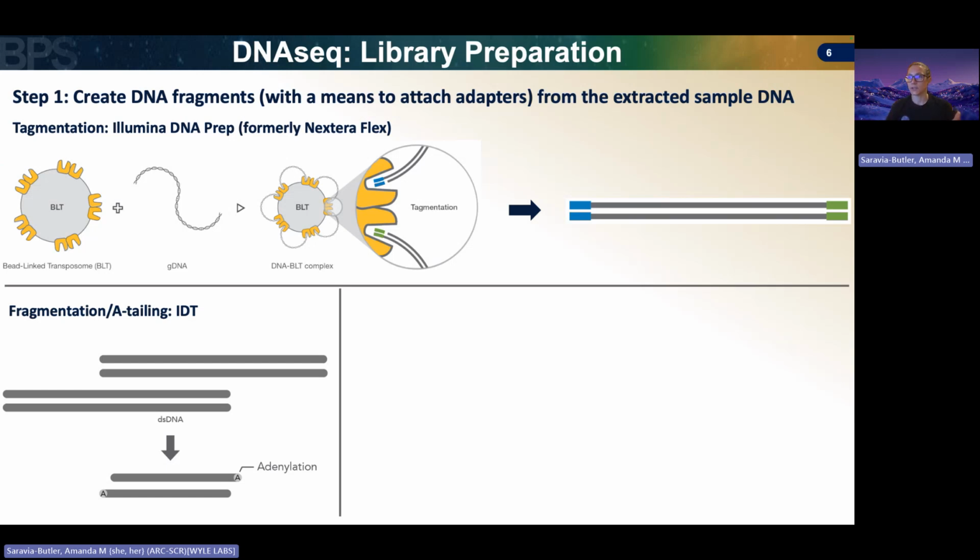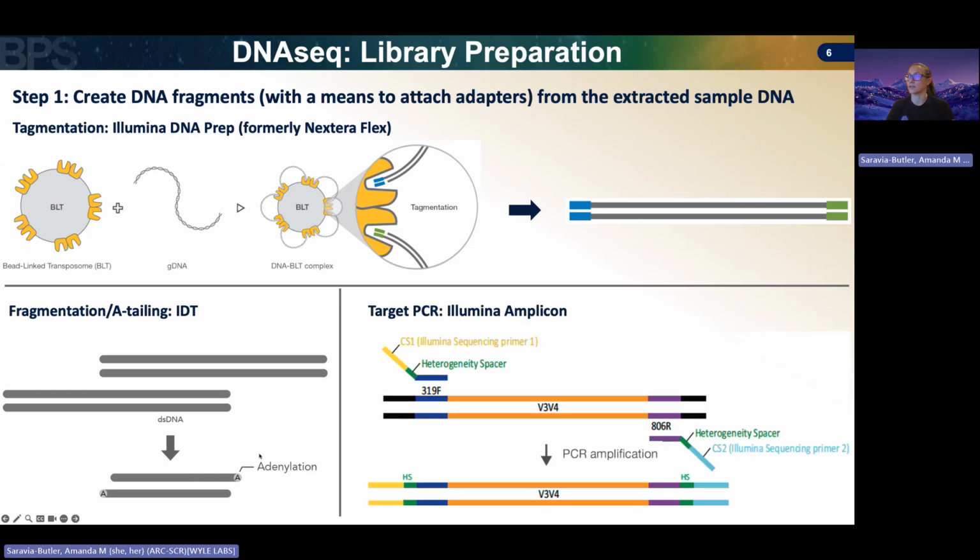And then once you have these shorter pieces of DNA, we are utilizing something that we have in our own cells that adds adenosine nucleotides to the 3' end of blunt fragments. It's an enzyme called poly-A polymerase because it will add adenosines to that 3' end. And so here we just add 1 adenosine to the 3' end of either strand in our double-stranded DNA fragments. And that's going to be important, as we'll see in the next slide.